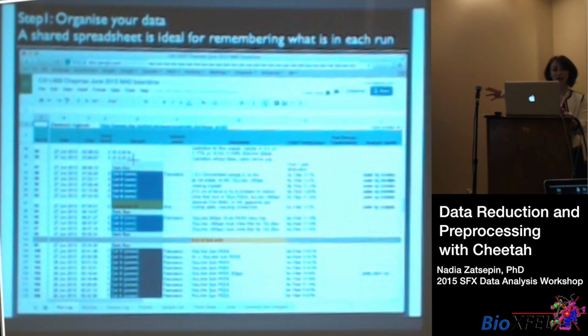X-ray parameters that you change, the sample delivery system, things you change, whether you're changing your nozzle, is the sample continuously clogging, things that you may not have considered from experiments at a temperature. You will definitely need a dedicated logger. And it sounds like a very unrewarding job. There's almost nothing more crucial than having a record of what you've actually recorded. Walking away with 100,000 patterns that are excellent, but you don't know where they came from, except the sample names.